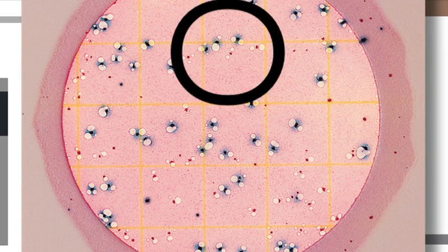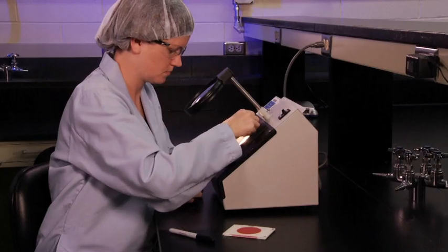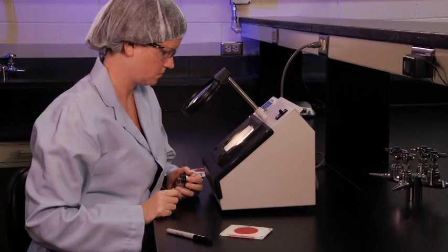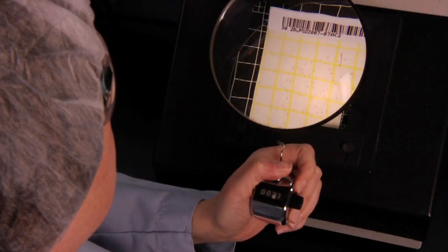The total coliform count is determined by counting all red and blue colonies associated with gas bubbles. Good lighting is necessary for accurate counting. An illuminated magnifier and a hand tally may help for counting bacterial colonies.